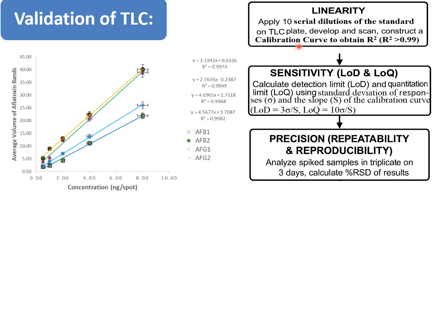Now, the reproducibility is defined as the variation performed by different analysts on different days or using different equipment within the same laboratory.